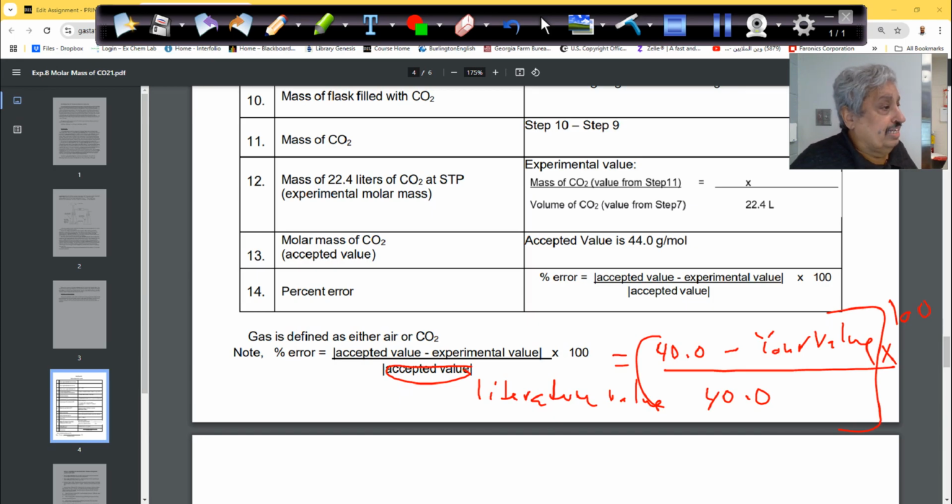It will become calcium chloride, CO2, and H2O. That you can dump in the sink, but don't dump leftover crystals of calcium carbonate, of marble chips. Just kill all those calcium carbonate by adding more HCl in a beaker, and then you can rinse the whole thing together. So I think that's all.